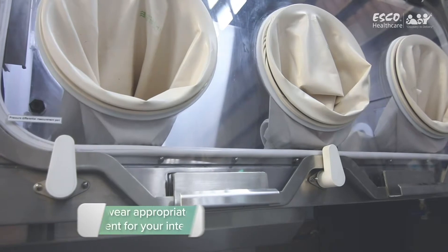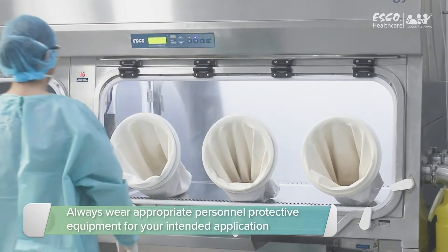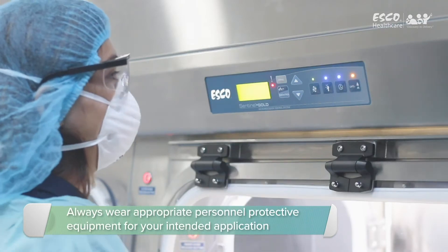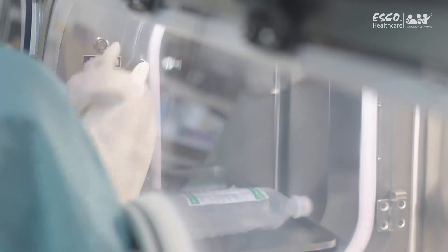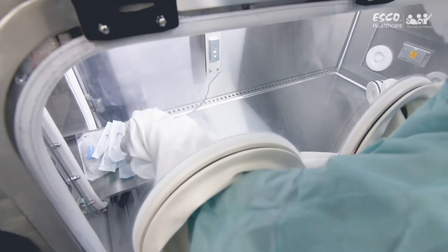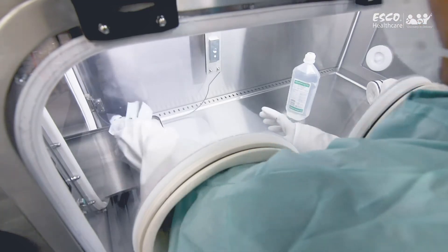Both the gloves and sleeves will be contaminated over time, so it's advised that during this replacement procedure, the appropriate PPE should be worn. The schedule of the glove and sleeve replacement will be dictated by the isolator's intended application and the usage frequency.